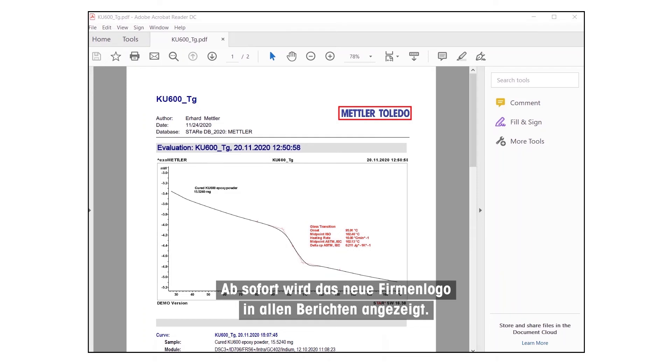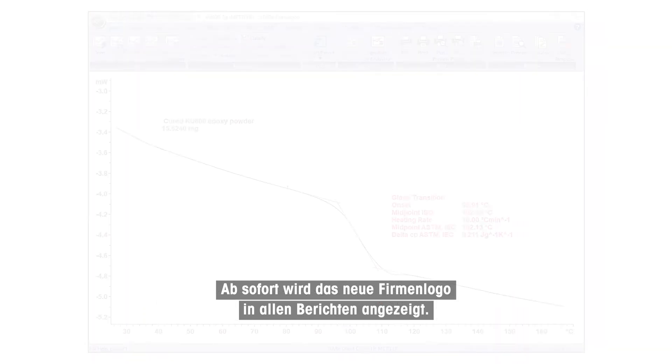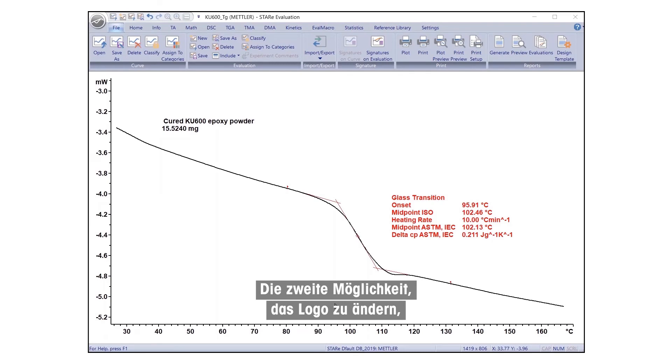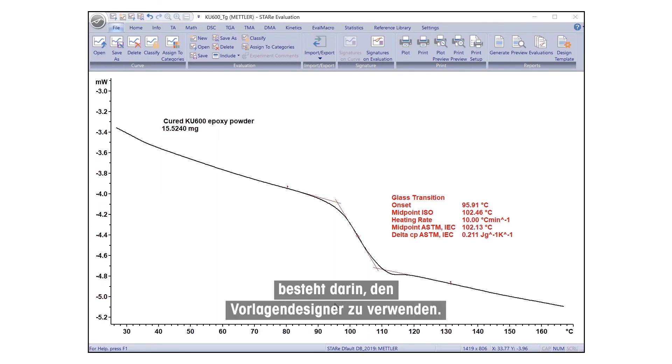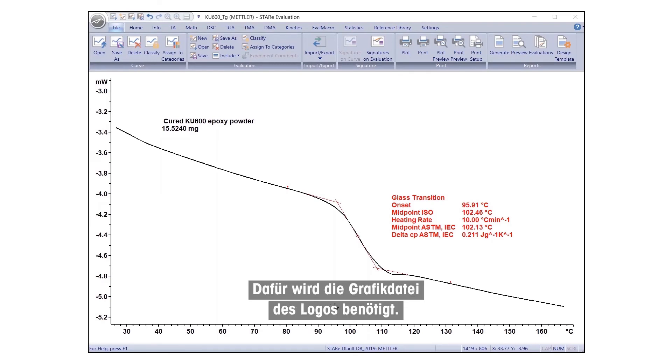From now on, the new company logo will be displayed in all reports. The second option for changing the logo is to use the Template Designer. For this, a graphics file of the logo is needed.